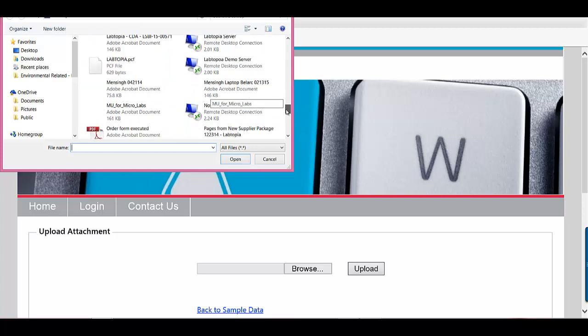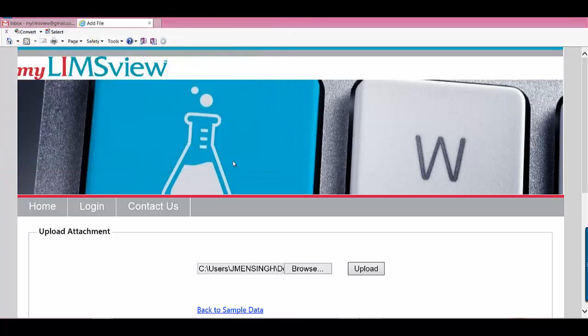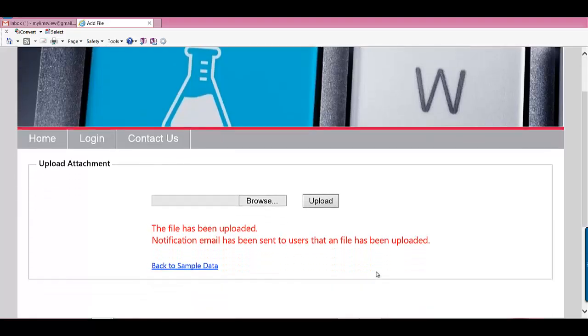We'll scroll down. There's a sample test report. I'm going to save that. Upload that to the system. What that does is it uploads it and it sends an email.